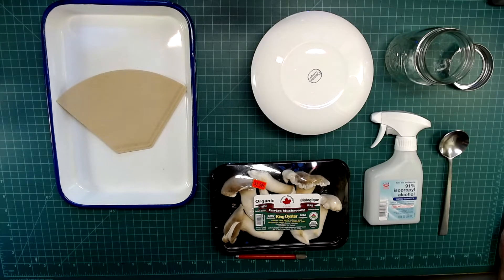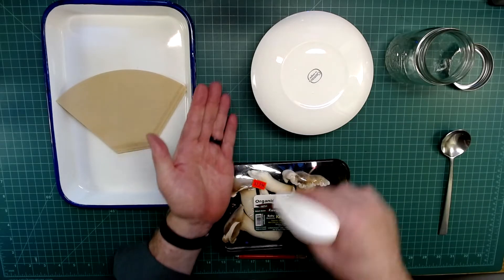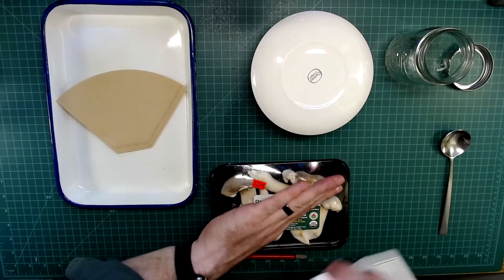This video is going to walk through the process of growing mycelium in coffee grounds. The first thing I'm going to do is sanitize my hands and the tools that I'm working with using some 91% isopropyl alcohol.